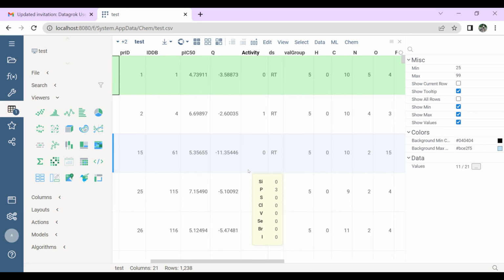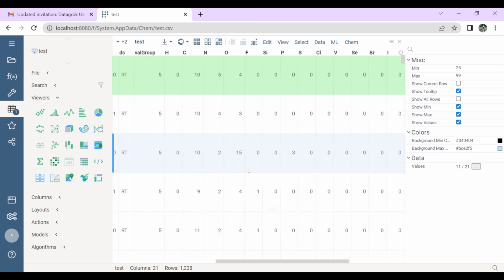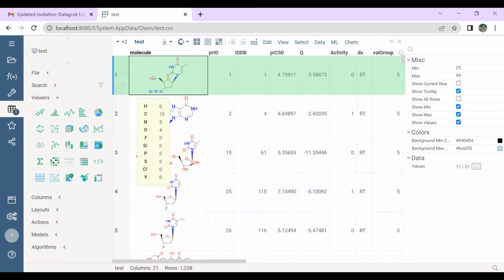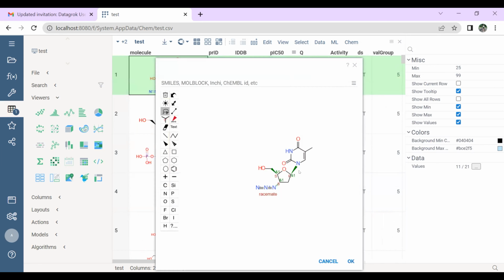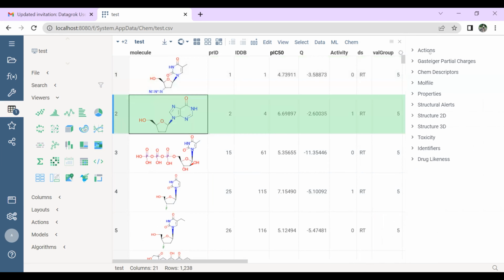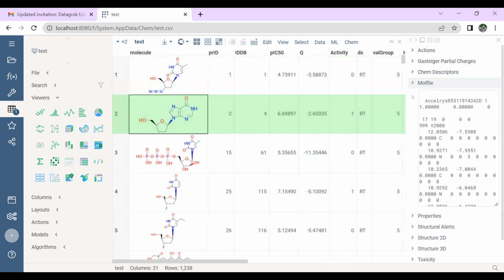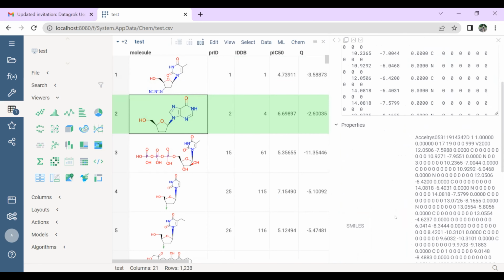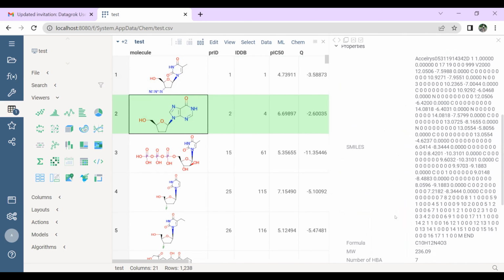Yeah, actually, Dima, we have that already. Alexandra, can you please scroll to the left to show the structure? To the left. Yes, right. Now click on the structure. No, just click on an element to change it in the property panel. Click on the molecule in the second row, please. Okay, yeah, now open properties. Nope, not the mol file, properties. Yeah, so here you see the formula.